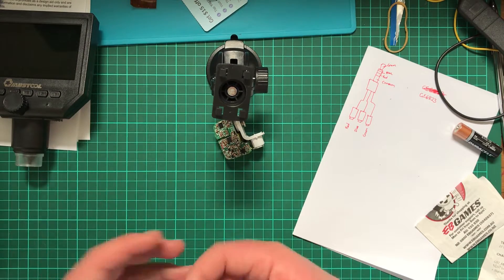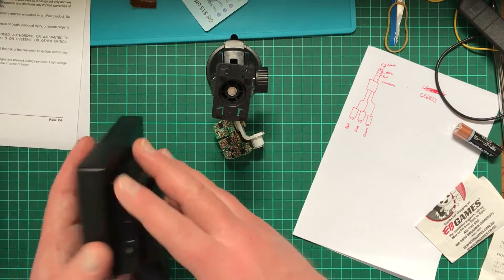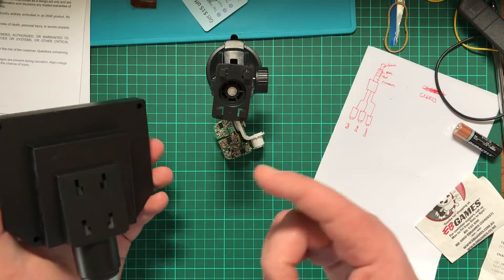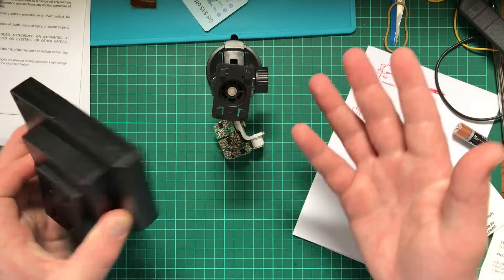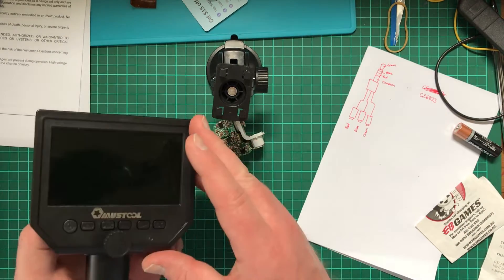For a hobbyist that wants to take a closer look at something, this is pretty okay. It allows you to take photos and you don't require a laptop or another computer to connect to. The downside is there's no way to connect an external monitor to it on the outside, which is a bit disappointing. Your VGA output might have been pretty crappy, but it could have worked.